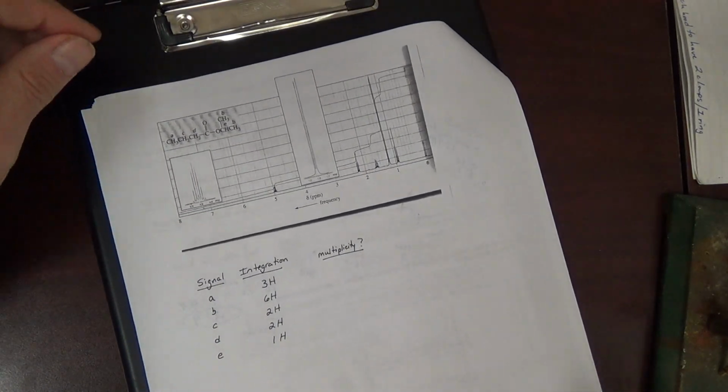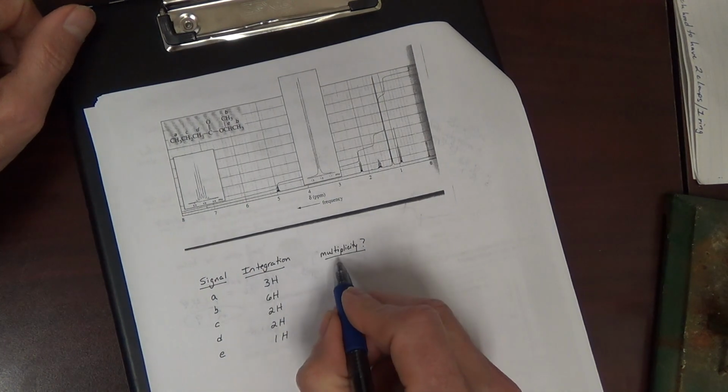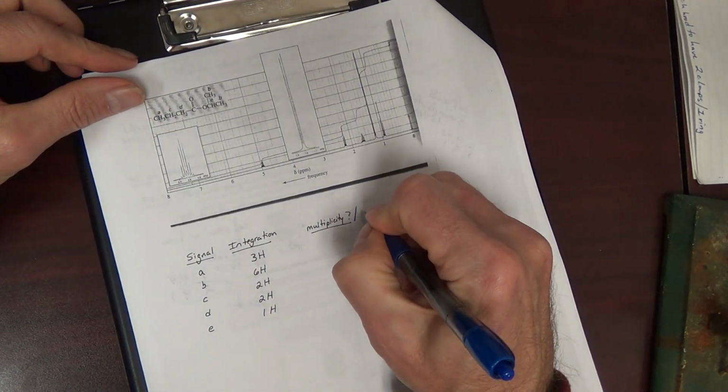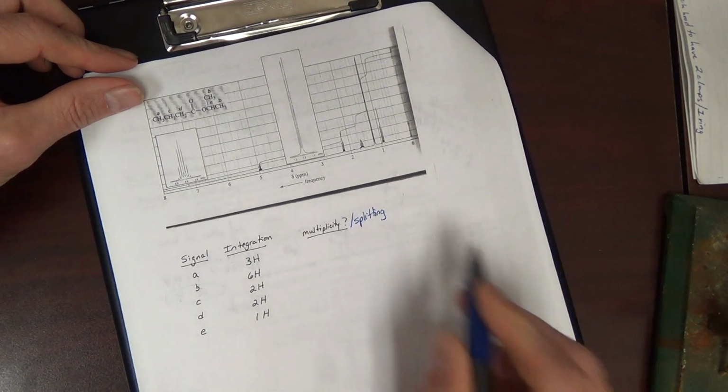Really, I'm going to end this video right here, and I want you to think about the multiplicity, or splitting. Okay, I'll call it splitting. What splitting do we expect for signal A?